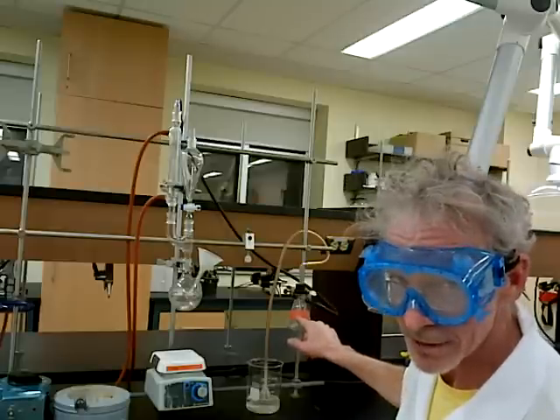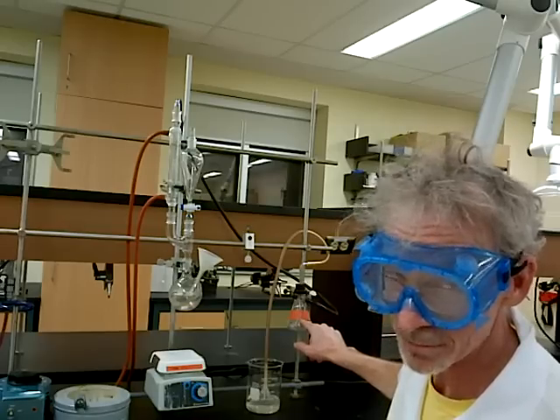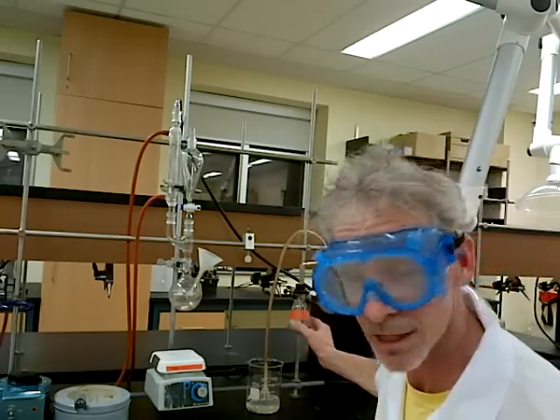This has to be empty. Don't let the lab manual fool you — it might look like there's something in there, but this is empty. Please, it's the trap. It will save your life.